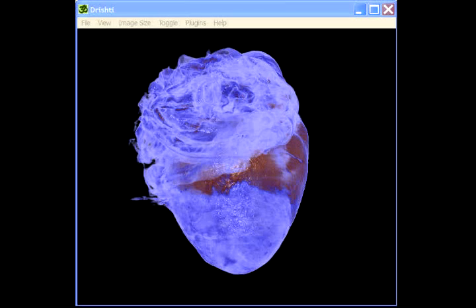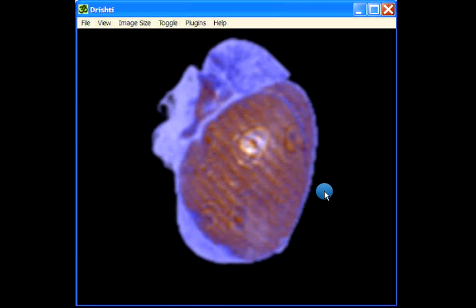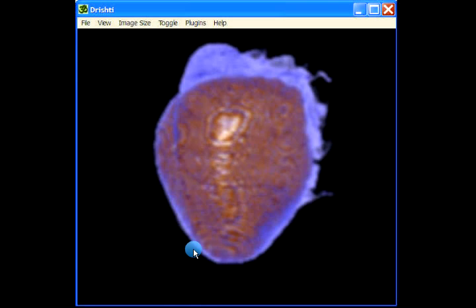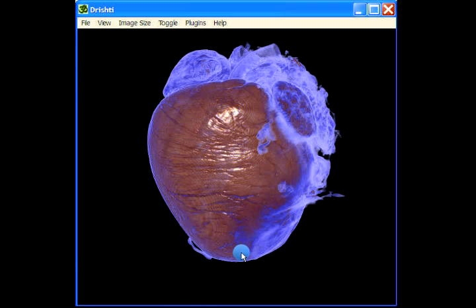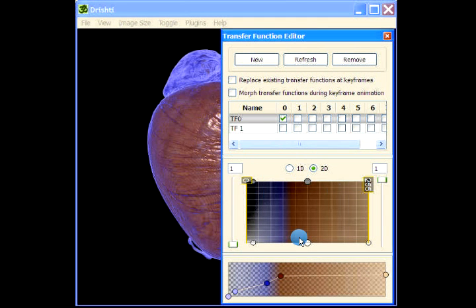In this video, I will show you how to use clipping planes to have textured slices or planar cuts through your data, and those planar cuts textured with whatever transfer function that you want. Now here I have got a heart dataset courtesy of Harris Morrison. This is an OPT dataset, and what I'll do now is apply cutting planes or clipping planes, and then texture those clipping planes with a given transfer function set. So here I have got the transfer function. So this is one transfer function that we are looking at.